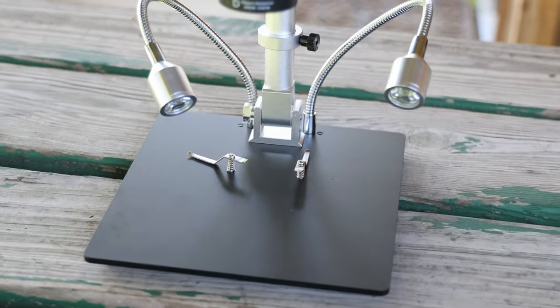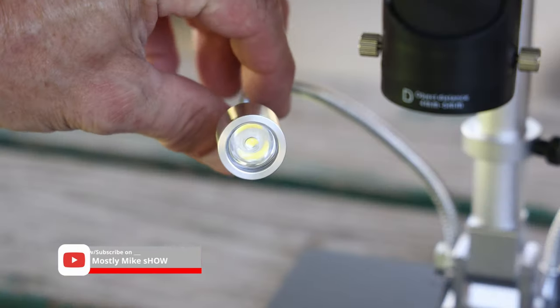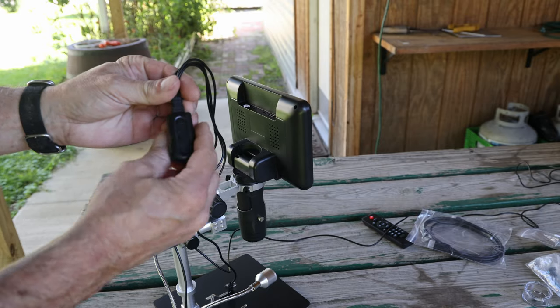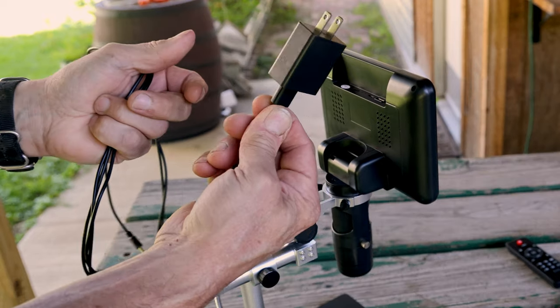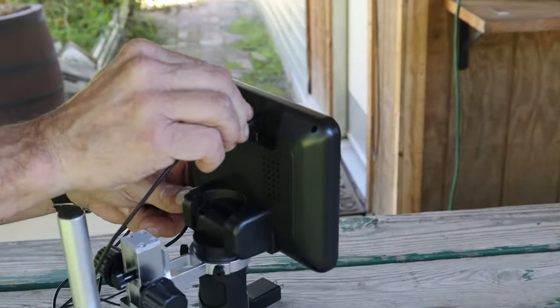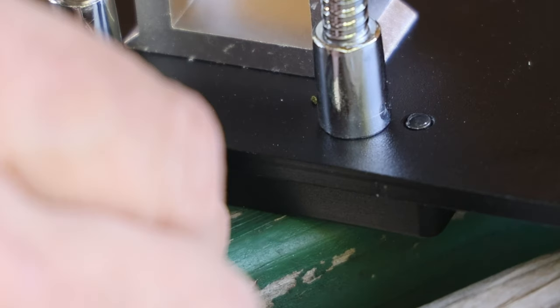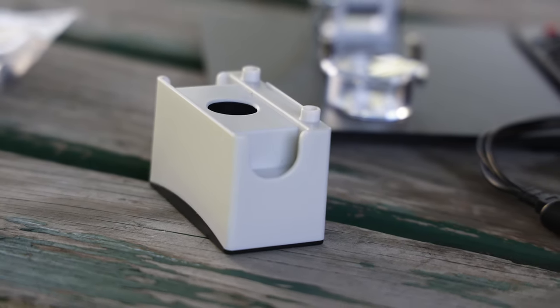There's an aluminum base with optional spring-loaded hold-down clips, and two gooseneck lights which are dimmable using the little pendant control. The pendant control has three cables attached. One goes to the included wall adapter. There's a right-angle micro USB cable that goes to the top back side of the monitor. And there's a cable with a round end which supplies power to the gooseneck lights or the lighted base for viewing slides, but you can't use them both at the same time — you have to choose.